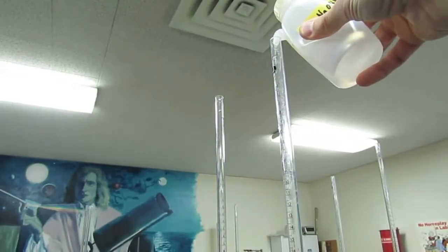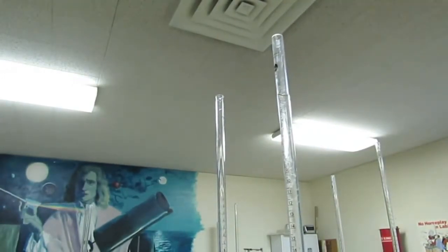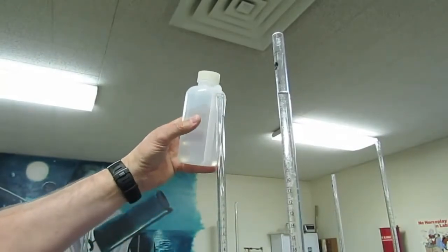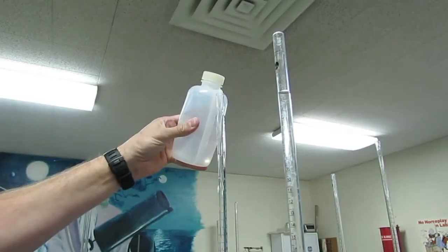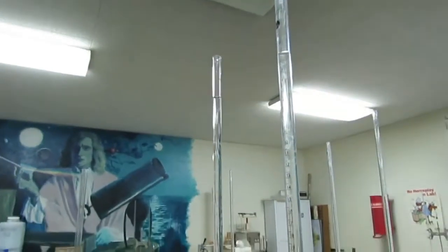Actually, we'll go just before the 0 mark since the tip of the burette's already filled. And then on the left-hand burette, we'll do the same thing, but of course we'll use our 0.100 molar hydrochloric acid. Remember, keep the acid on the left. If you get those mixed up, we'll end up with some problems.